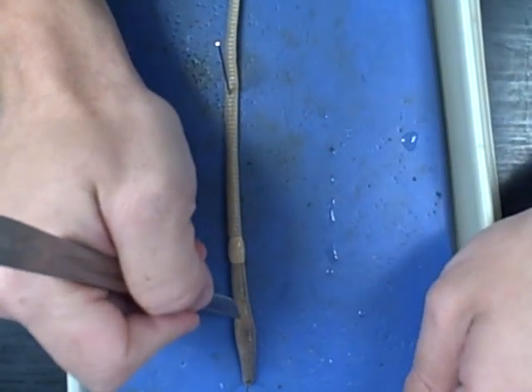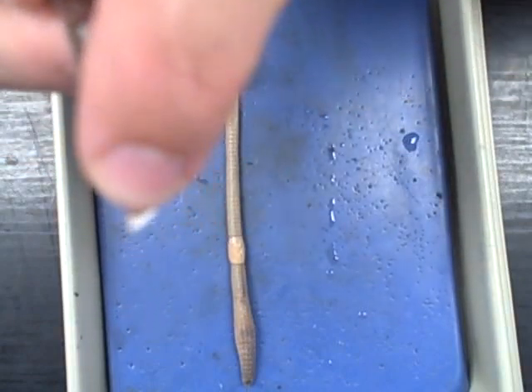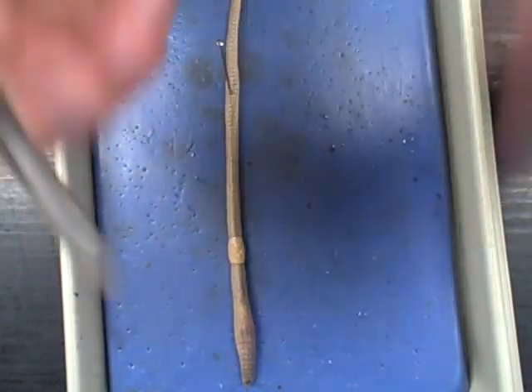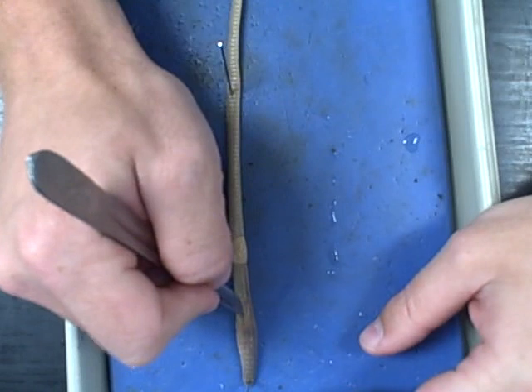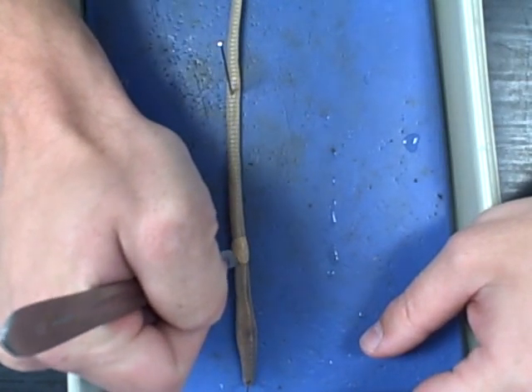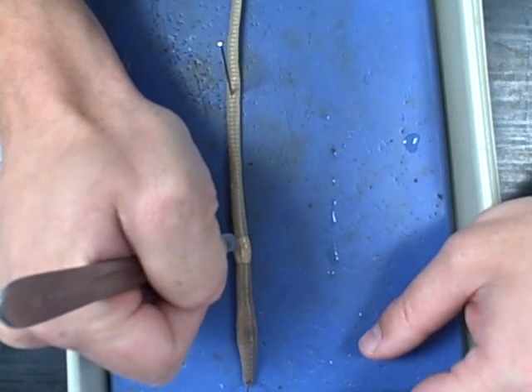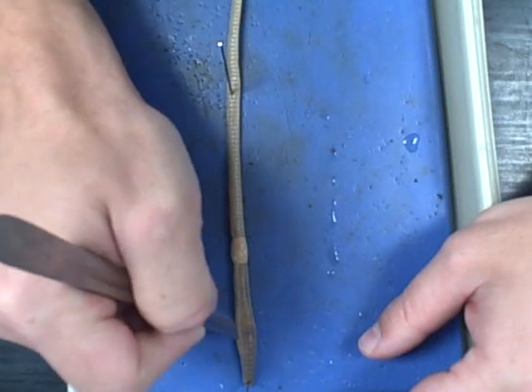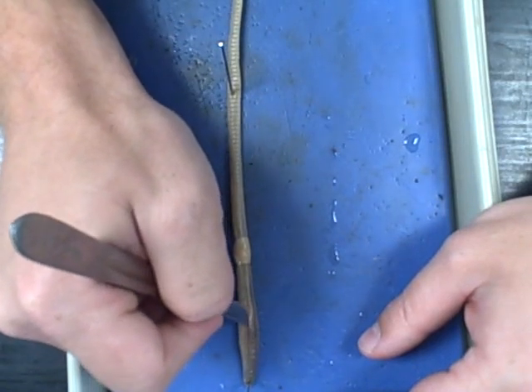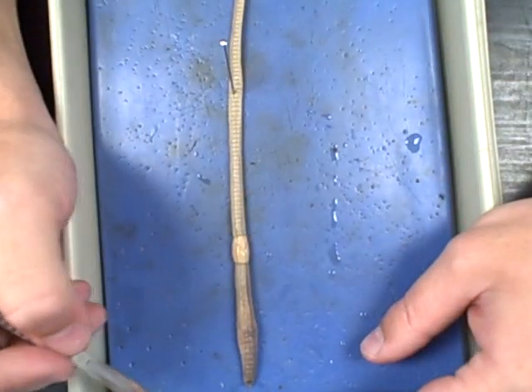It doesn't have to be very deep at all — I'm only going in probably about that far with the blade, just going across the top. It may take you a couple of times to cut through. Just go back and forth depending on how sharp or dull your blade is. You want to take it to the clitellum, and then you can stop.